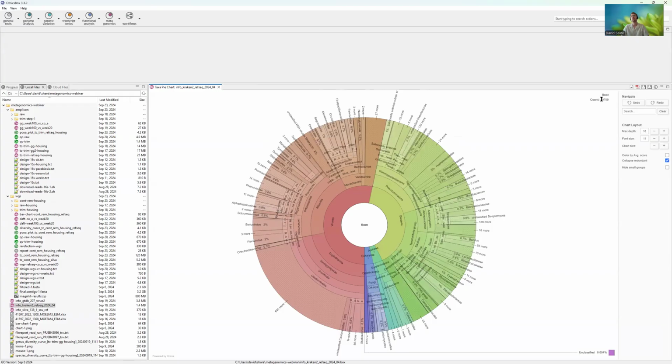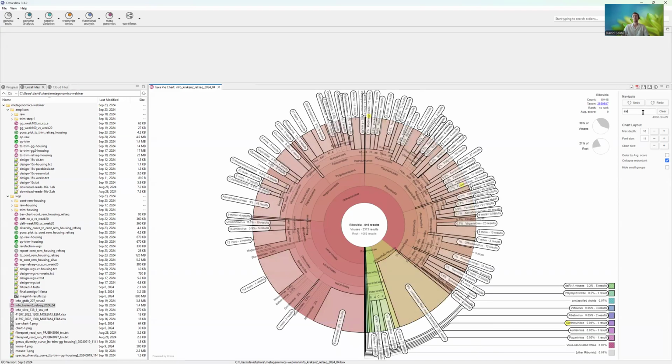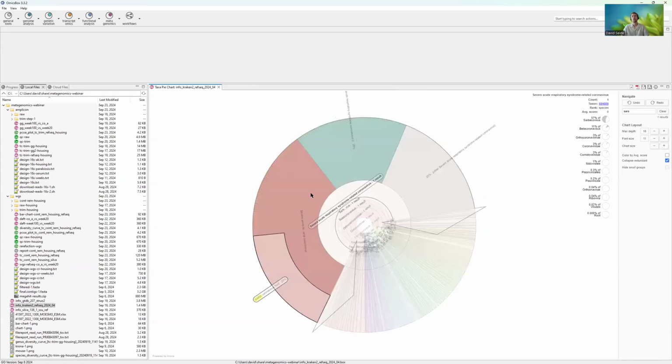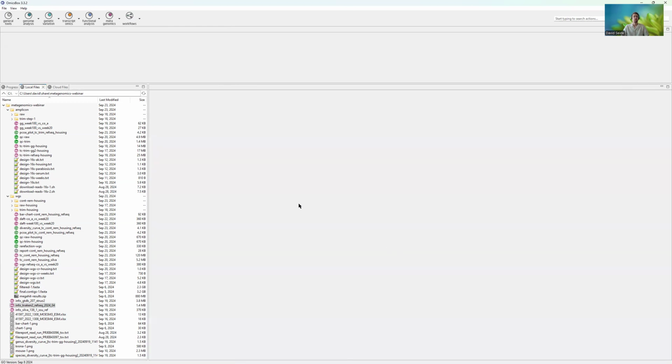We have nearly 50,000 different taxa in here: viruses, bacteria, archaea, eukaryotes, and you can look around, search for anything. What do I know? SARS. To see if it is available and if you could detect it with this database when you use it. In this case, we have coronavirus in here, just as an example.